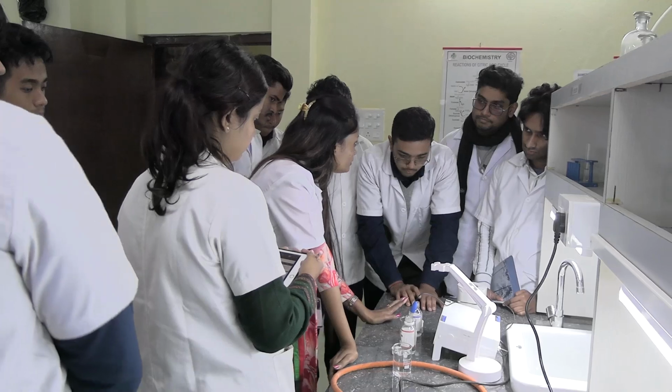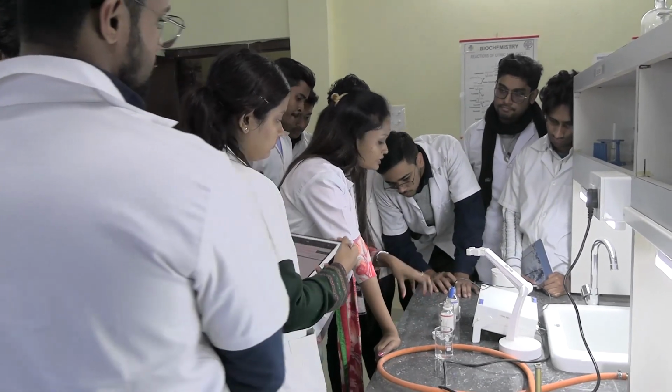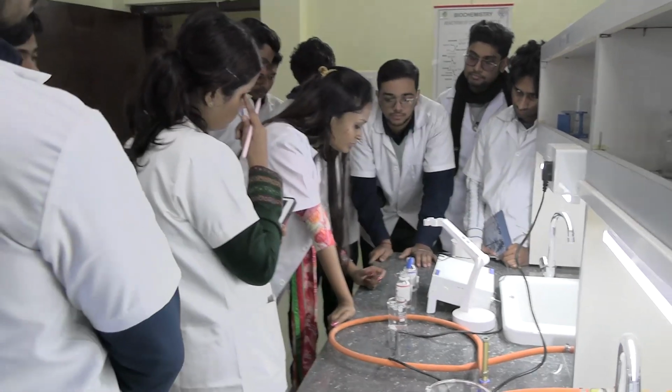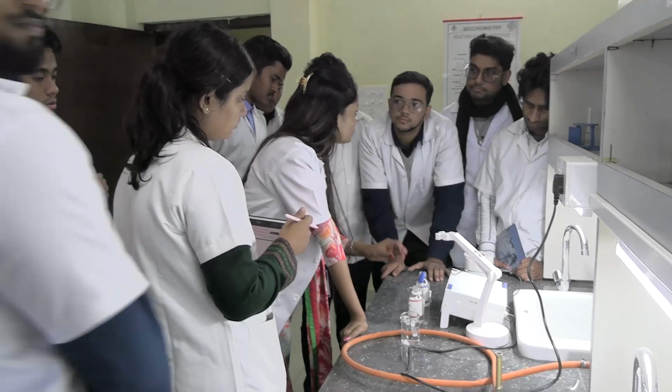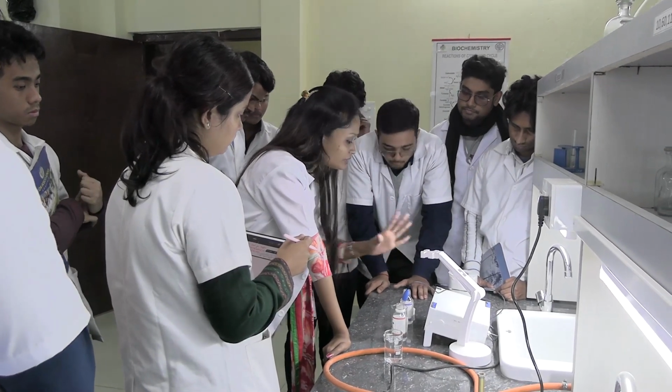What is calibration? Calibration means we know the pH of this solution, but the pH is not set in the instrument, so we are checking the preciseness of the result. This is calibrating the pH meter.